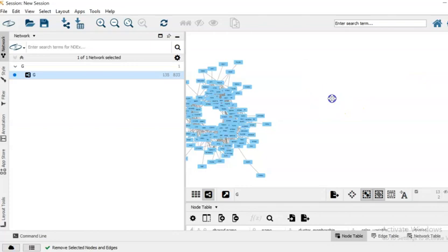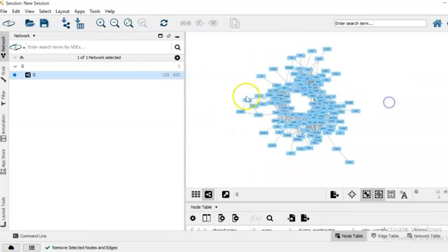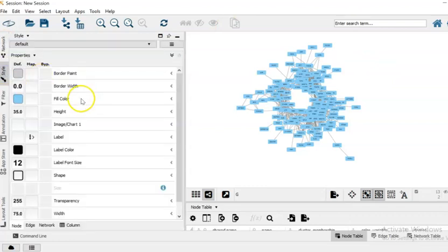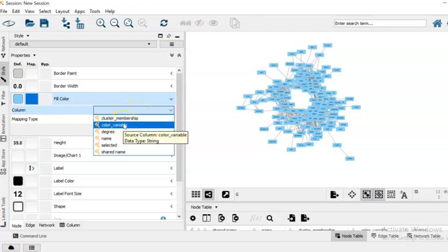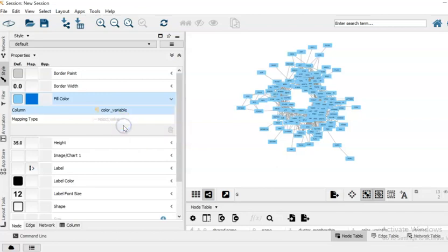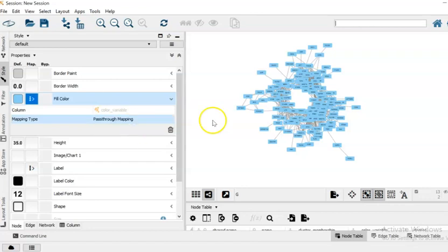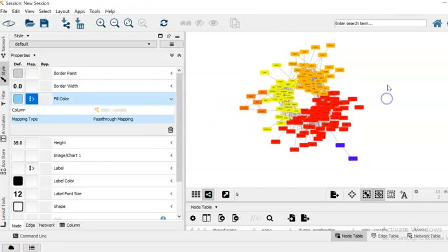Also disconnected from the rest of the much more connected graph. So in order to visualize the colors in the context of modules, we can go to style, then fill color, then select value. Now here you can see the attributes to our vertices that we have appended. What we want to select is the color variable, and from the mapping type we would like to select pass through mapping.